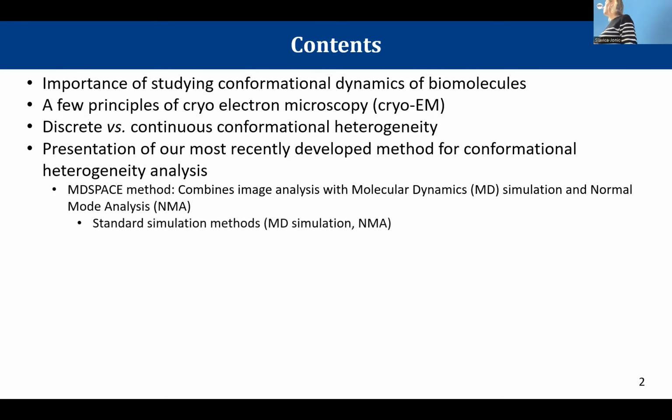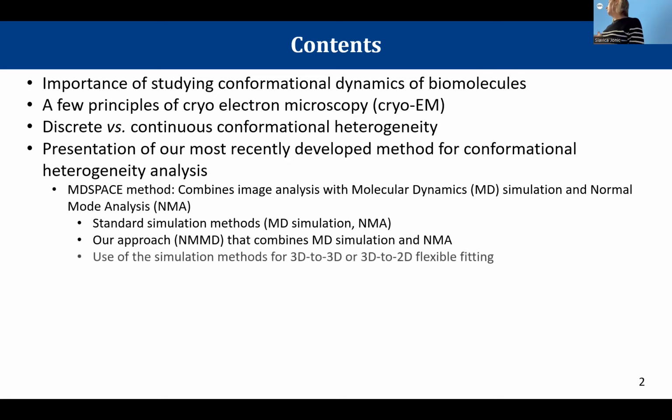In this respect, I need to introduce some simulation methods like MD, molecular dynamics simulation, and normal mode analysis. And then I will present the approach that we developed, actually my PhD student Remy Wilmot, who is currently a postdoc in a lab in Grenoble, that combines MD simulation and normal mode analysis to speed up this simulation. It is called NMMD, which we then incorporated in flexible fitting approaches.